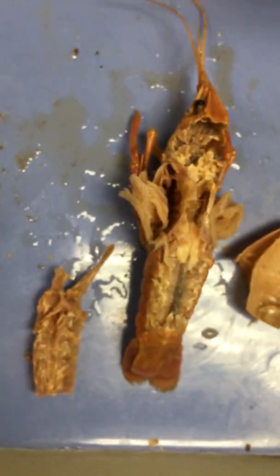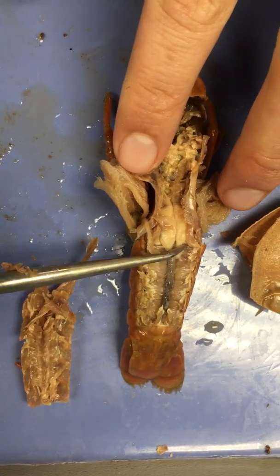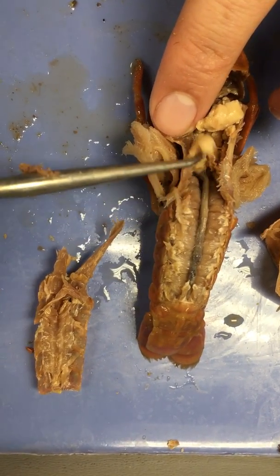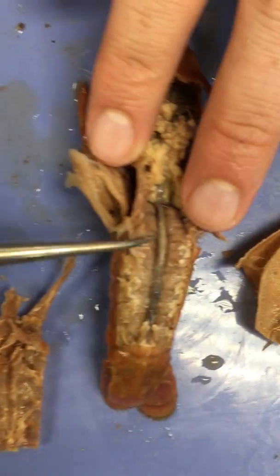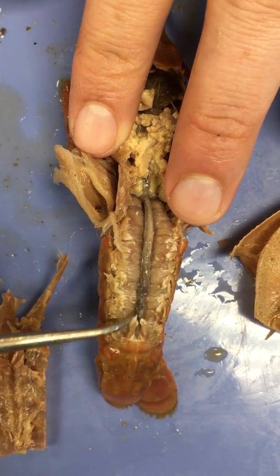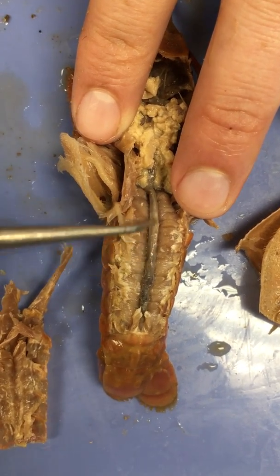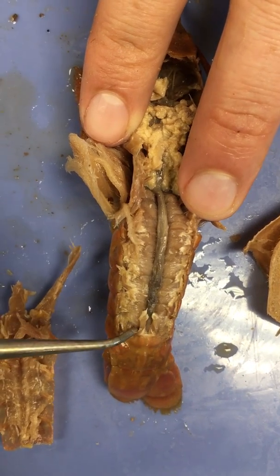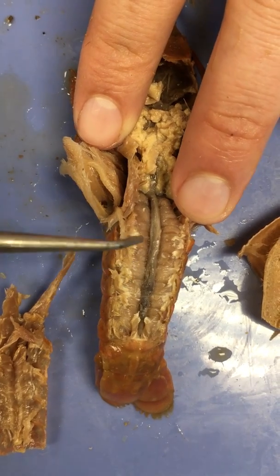Here we have two different aspects of crawfish musculature exposed. Before we get to the muscles, let's point out the intestine. After food is digested in the stomach, it's going to move to the intestine where nutrient absorption will resume, and then it's going to exit out the anus at the end of the tail.